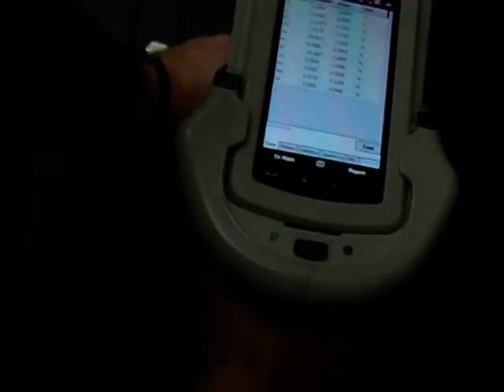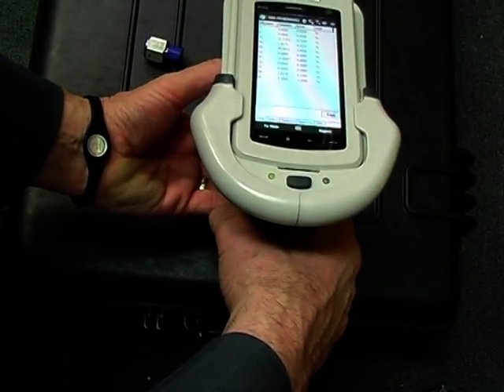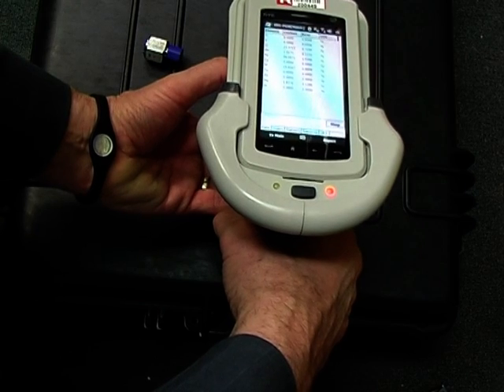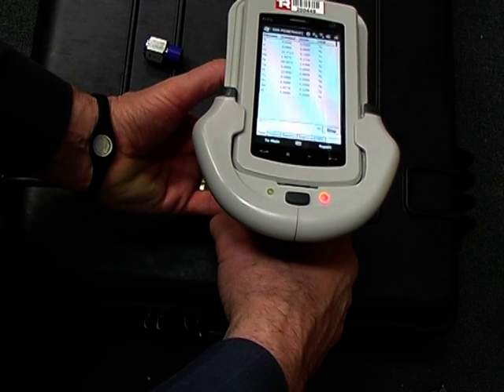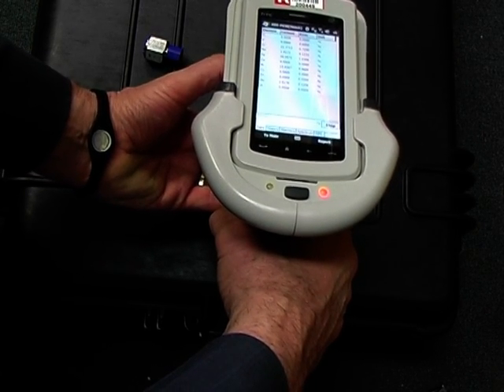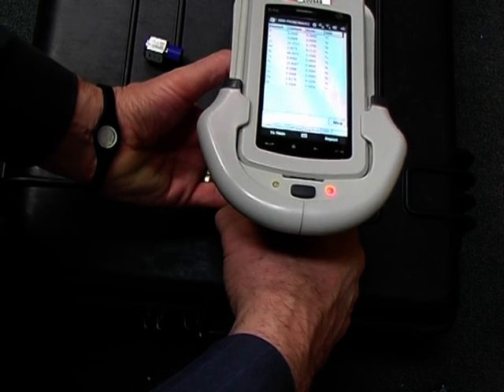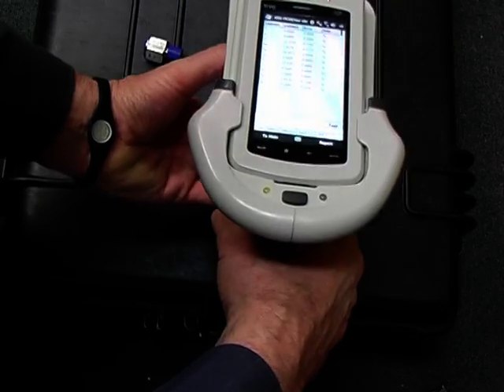Now I'll test my other test piece here. Point it at a fairly close distance and pull the trigger. The test light comes on. The test is counting down. Test is completed — release the trigger.